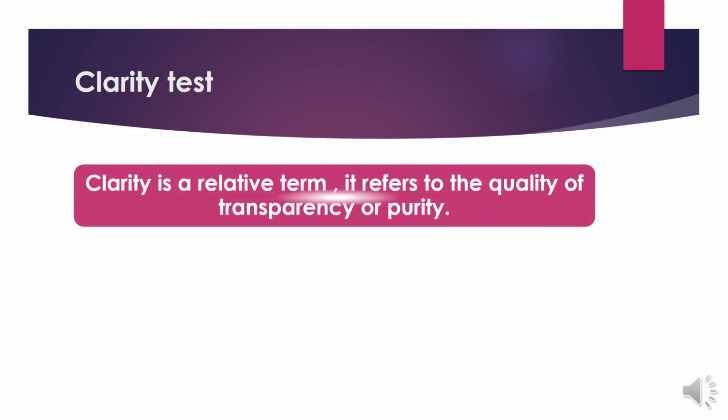So before moving to the actual clarity test, first of all we are going to discuss what clarity is. So it says clarity is a relative term. It refers to the quality of transparency or purity.